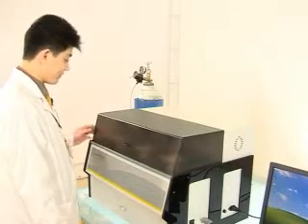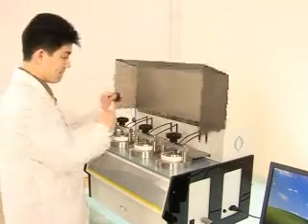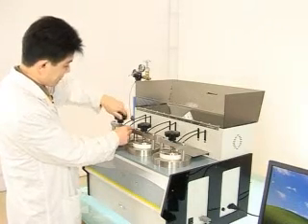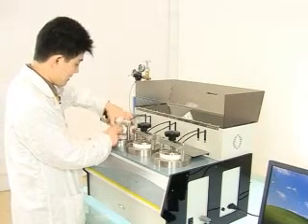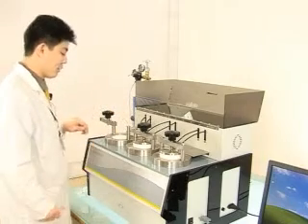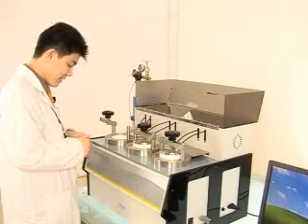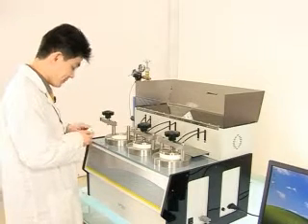Now I introduce how to install the specimen. Firstly, open the cover, and then turn this knob, open the chamber. When you open it, you will find two circles, this one and this one. You need to spread the vacuum grease between these two circles.